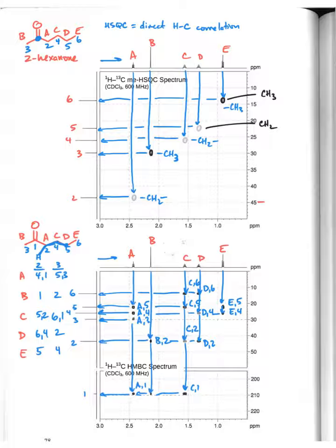And so what this is helping us is to map out these different relationships amongst the proton and carbon through multiple bond correlations. So what you're doing is you're counting the bond from the indicated hydrogen atom through to the adjacent carbons. And so you end up with these relationships that help us map our proposed structure and prove that it can only be that and not something else.